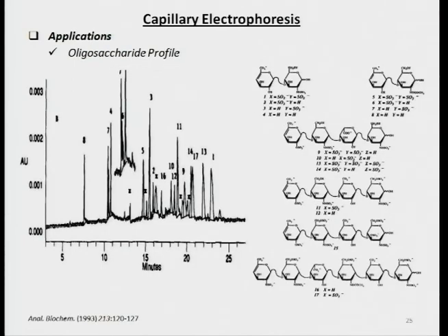Now this is something that was done a long time ago, and this is not just disaccharides, but tetrasaccharides as well as hexasaccharides of defined structure with fairly good resolution. And you can see that the complexity is huge. Some of the species are really not fully well resolved.